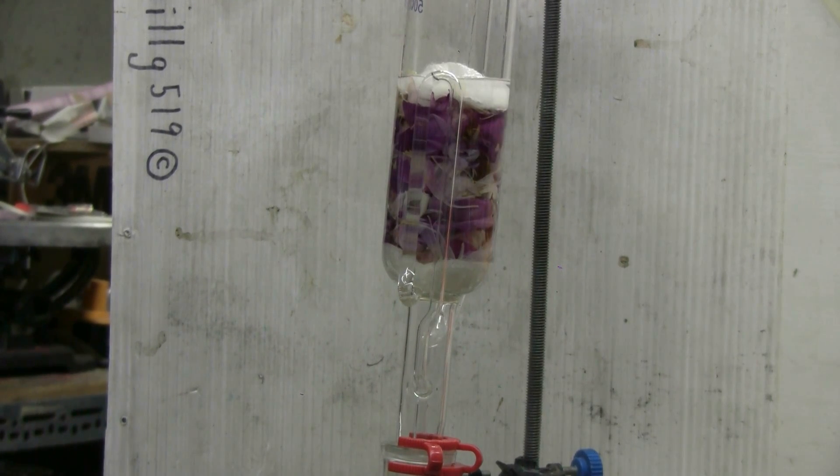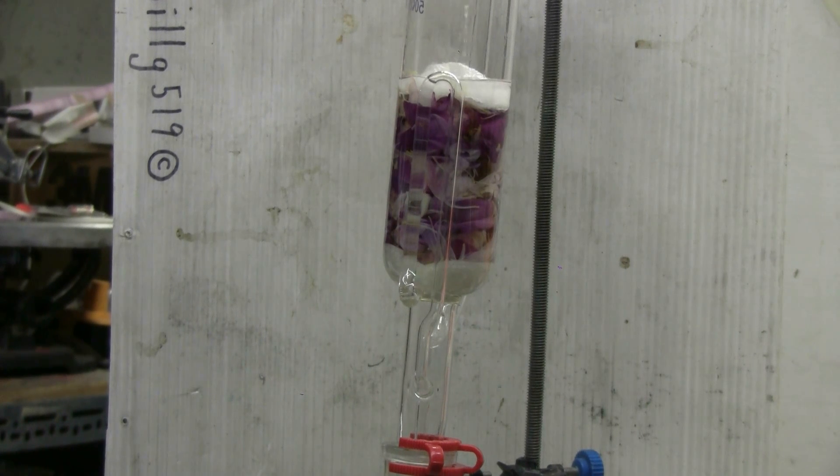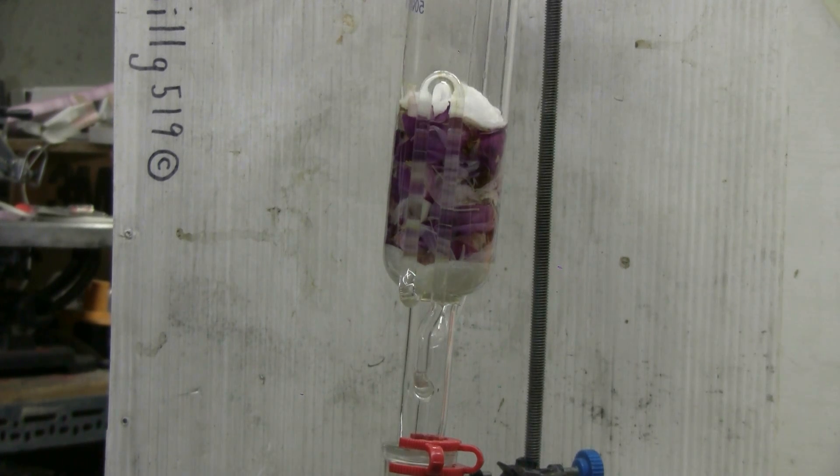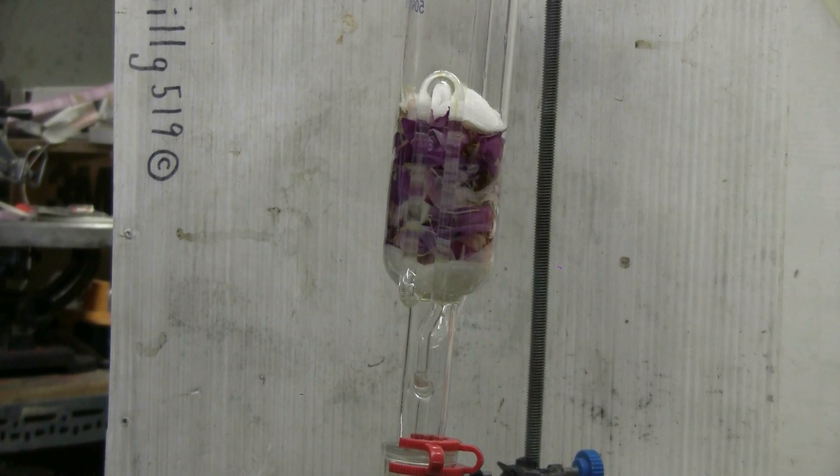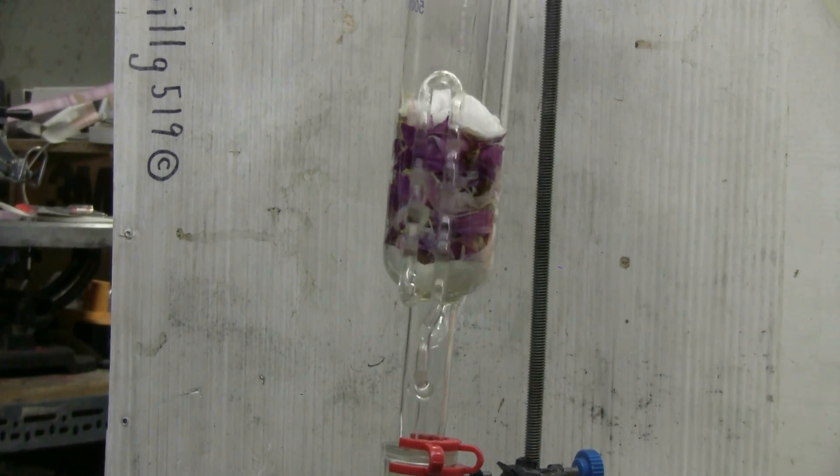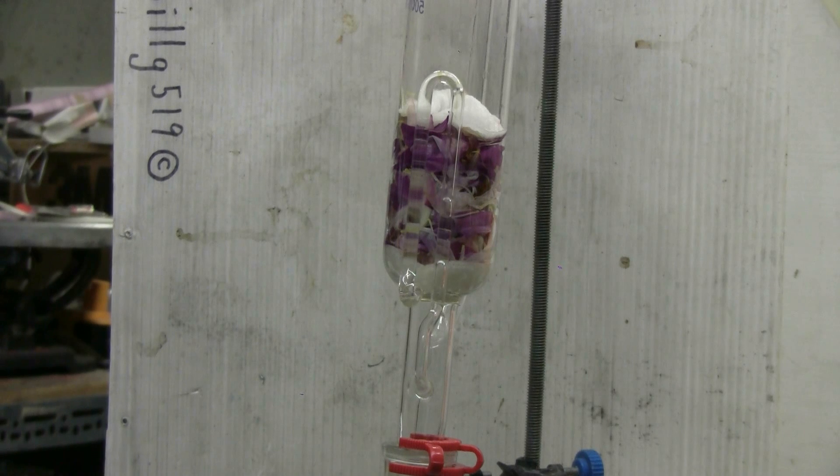Cycle number three here should turn over very shortly. It's just about ready. There goes number three. No color is being extracted from the flower petals by the ether.